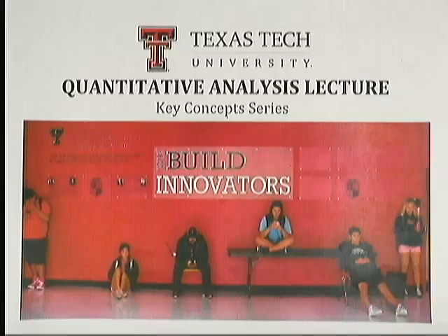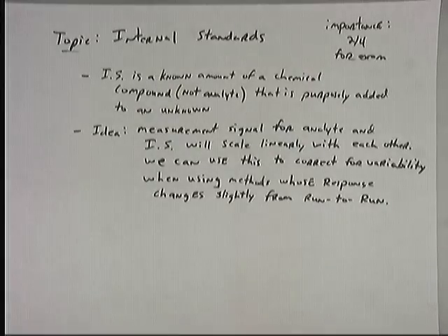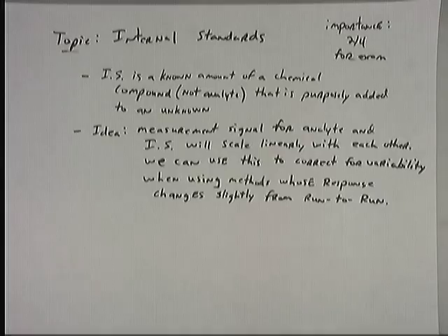Okay, the topic of this video is going to be something called internal standards. I think this topic is important for you to understand. You may or may not see it on your exam. I'm kind of giving it 2 out of 4 stars importance for your standardized exam.